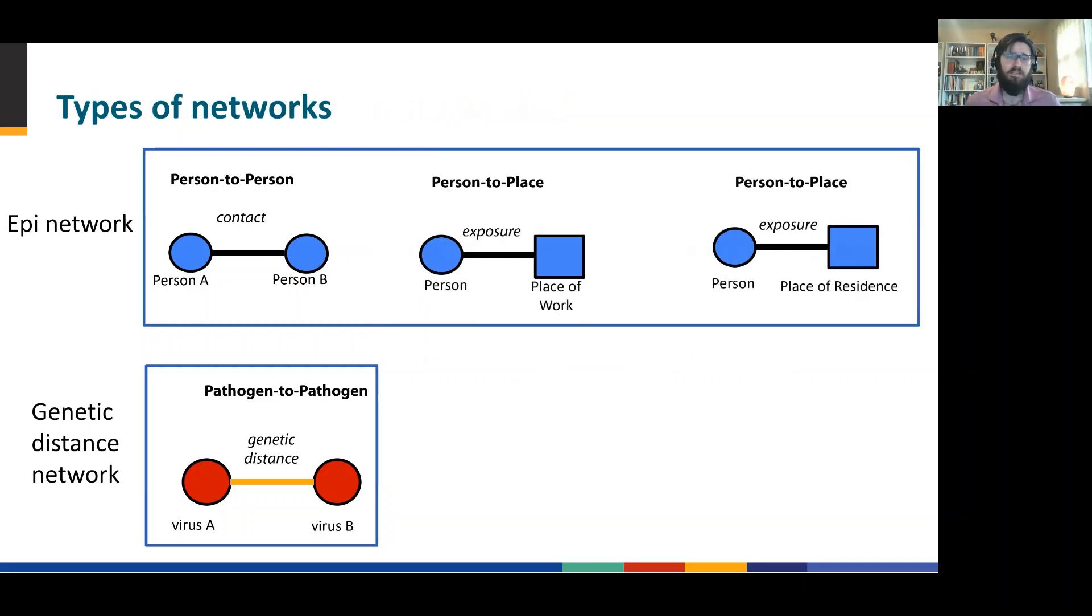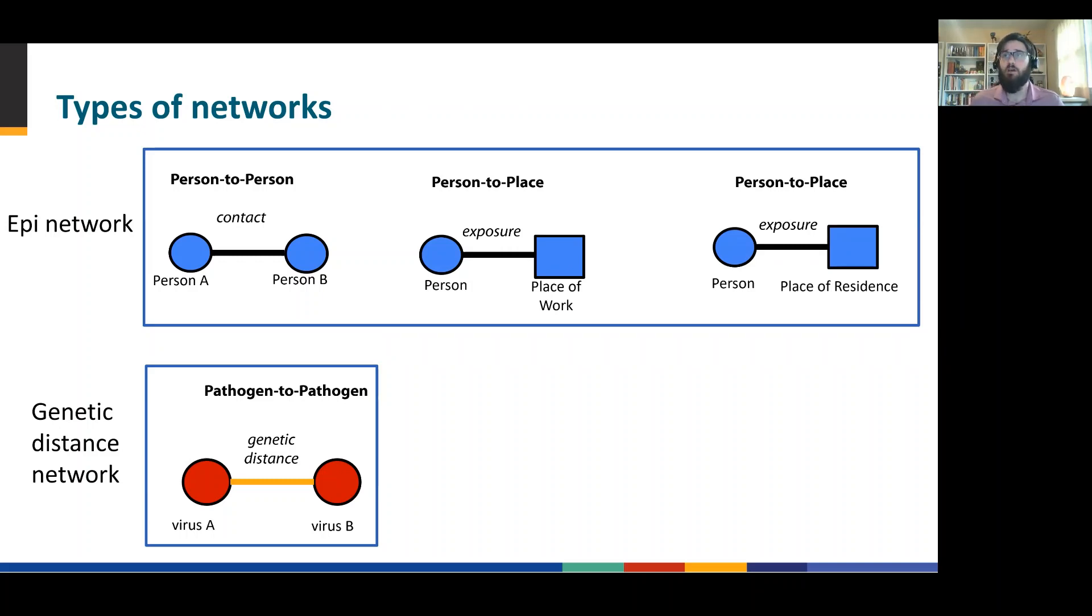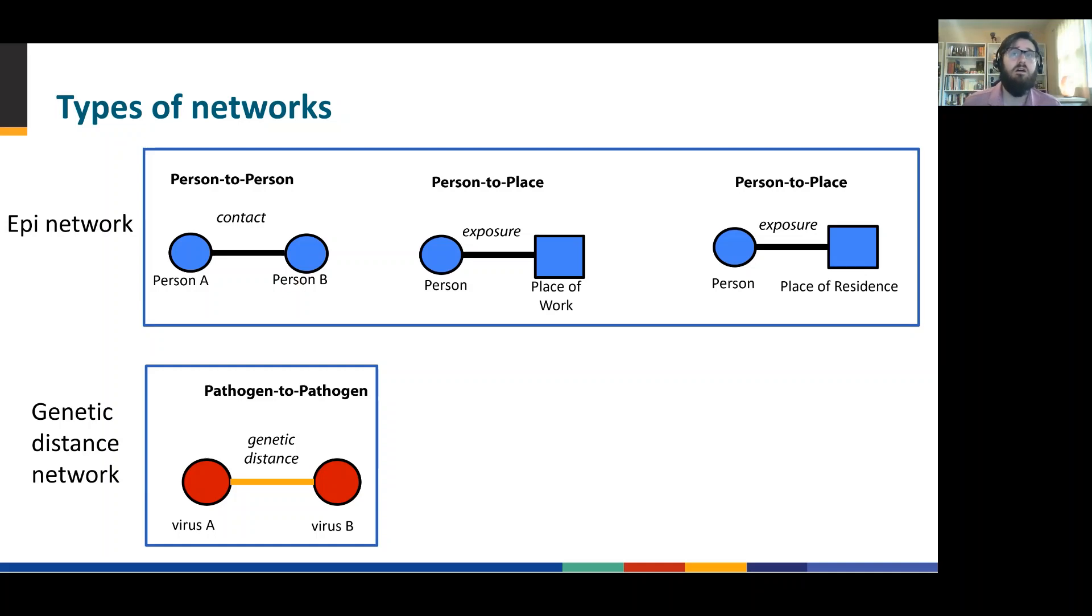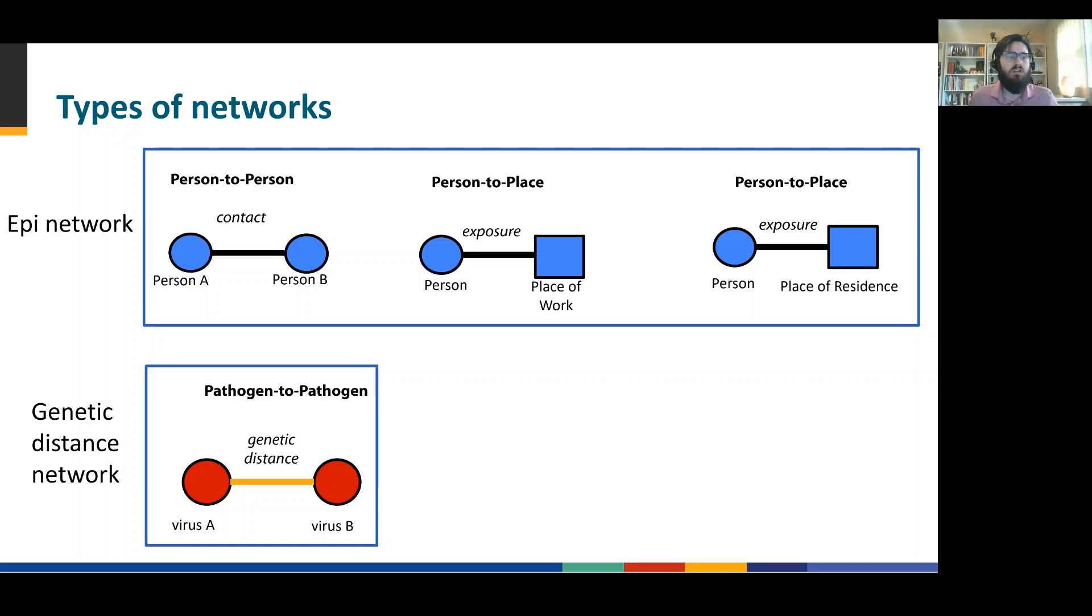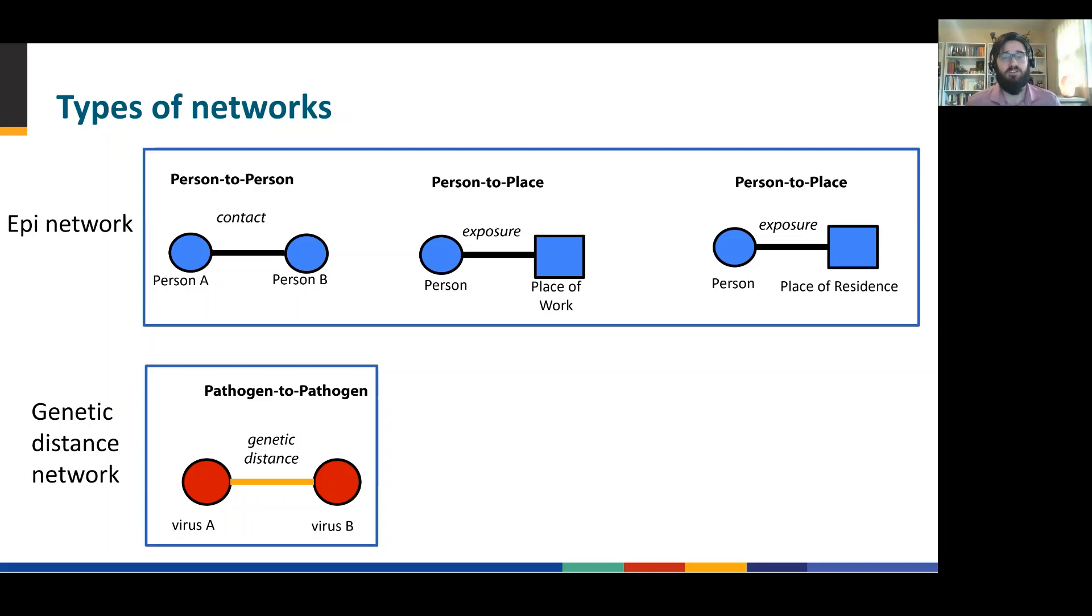Now in COVID, oftentimes folks don't have direct knowledge of who they may have come in contact with. So Microbe Trace enables you to encode data that indicates a person's place of work or a place of residence, wherever an exposure may have occurred, to visualize and map that on top of your genomic data.